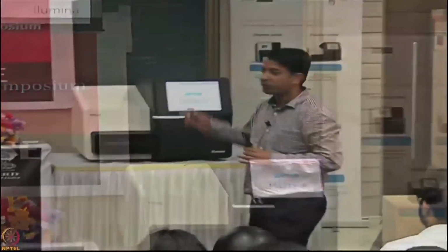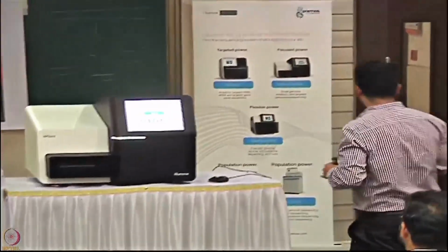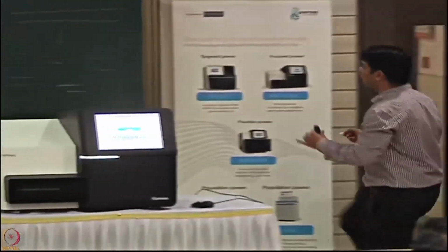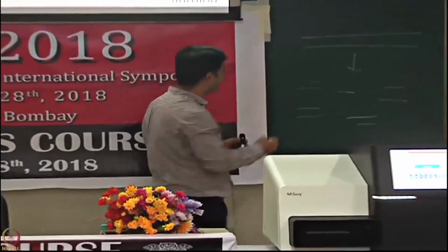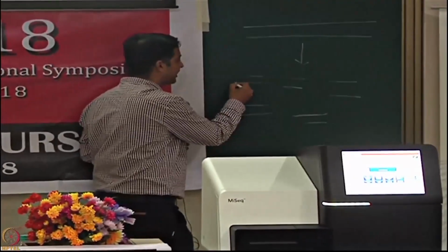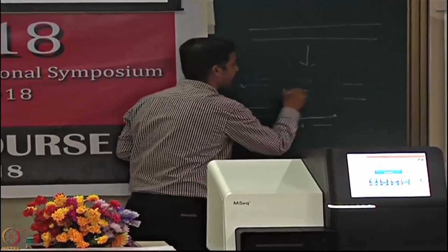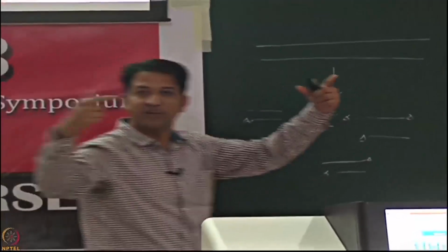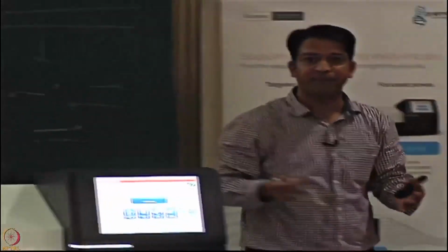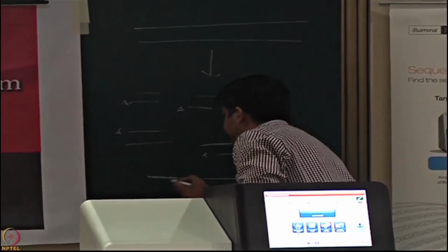Right, you remember now. So initially we will use a polymerase. If you have many fragments, initially we convert all the ends into blunt-ended, and you add a polymerase. The tendency of polymerase is that it will add an A to all the ends, right? And then we have an adapter which contains a T over there. There will be a simple ligation step. So those fragments will be converted into fragments ligated with the adapters.